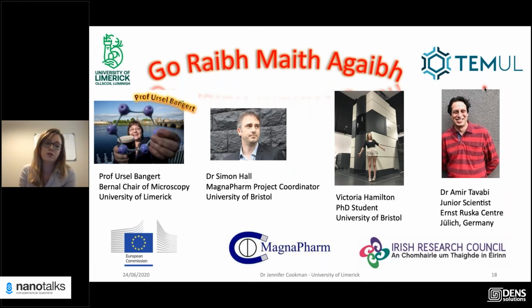But the STREAM does also have the capability of doing heating experiments and biasing experiments. And I think what will come in quite useful for the heating experiments would be even as simple as just keeping room temperature, or I see it as quite advantageous for the biological samples as well, to keep body temperature constant. So I think that's all I have to say about it.